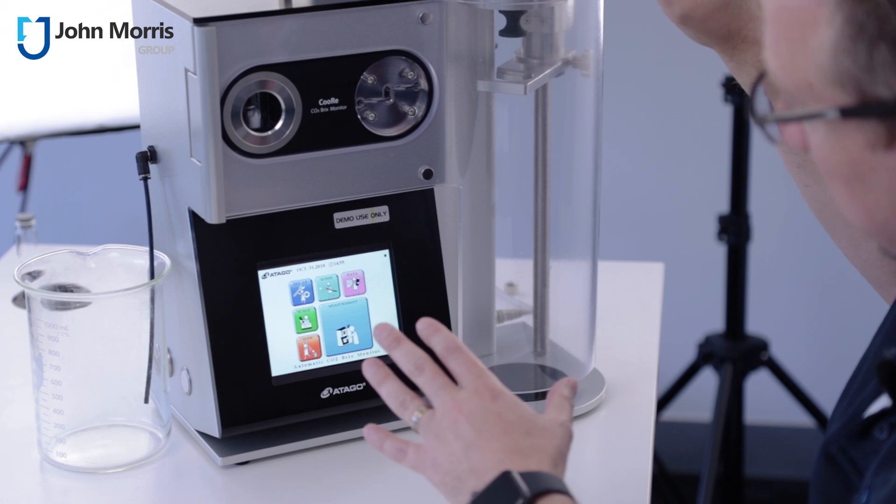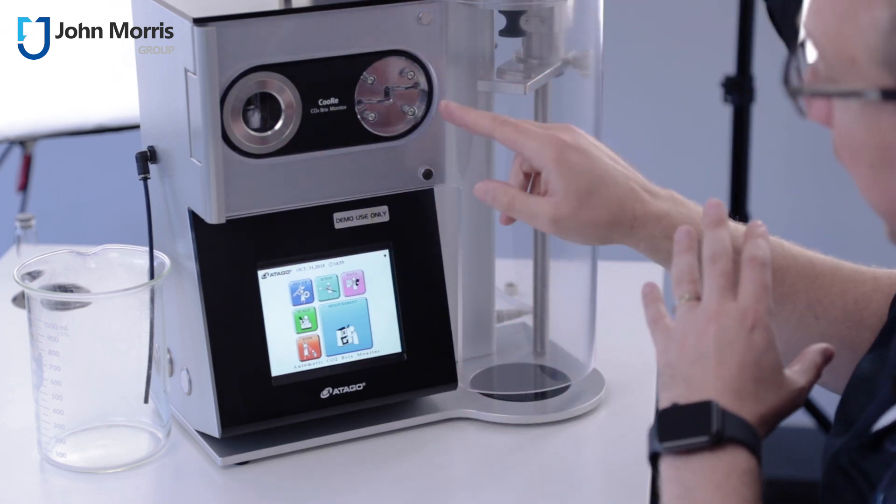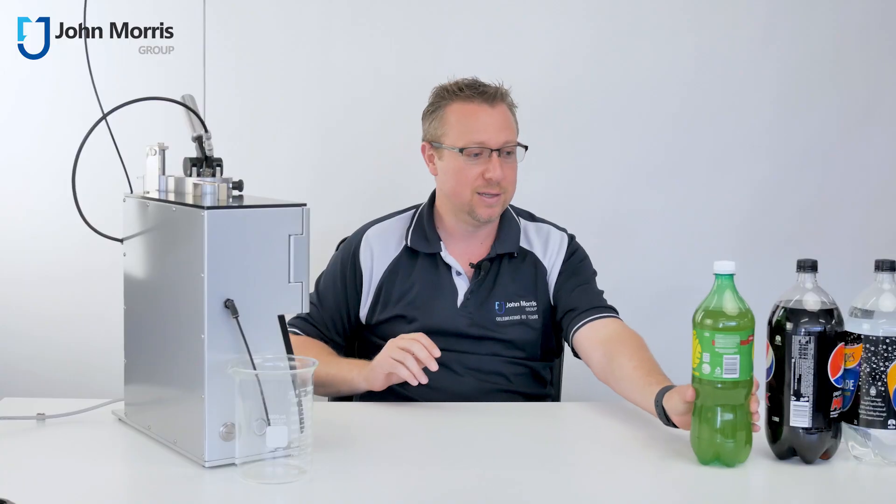There are literally things all over this device, but at its core we've got a component that measures CO2 and a component that measures Brix. Let's see how this thing actually works.